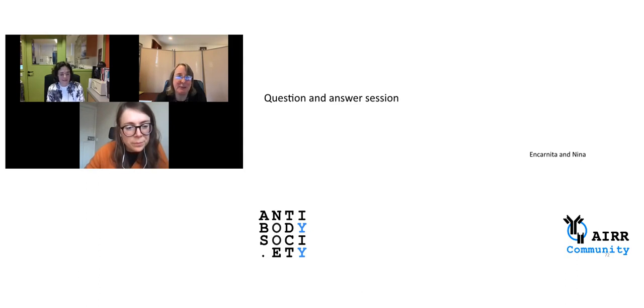Yeah, so I wasn't sure how much time we were going to get to answer these questions, so I did put a quick note in the chat also. So to Chen, thank you for that question. It's a really great question, and certainly we have not yet done that in pattern flow cells, but if you take a look at the paper from Frontiers in Immunology that came out a couple of years ago, there is a group in China that's been quite active in this area, and they have a nice description of dual UMIs with dual barcodes for antibody sequencing. So that may be something that you could look at as a potential source of method and result.